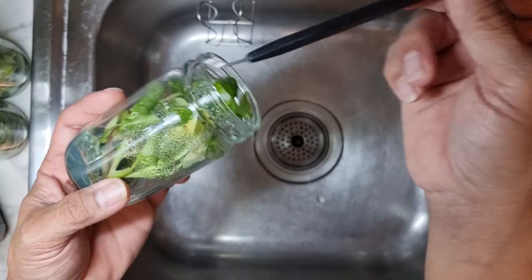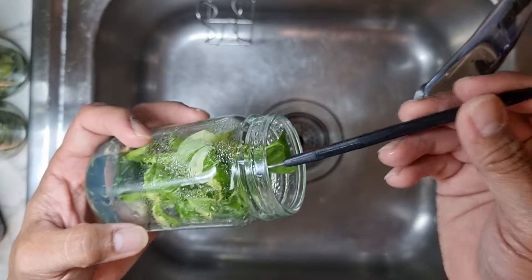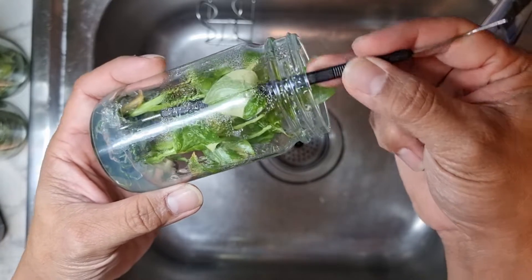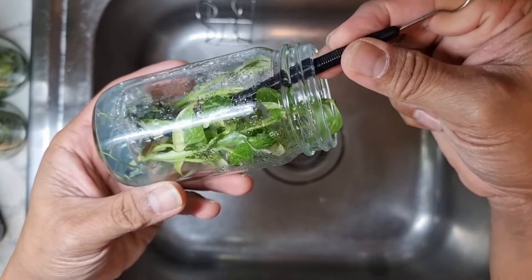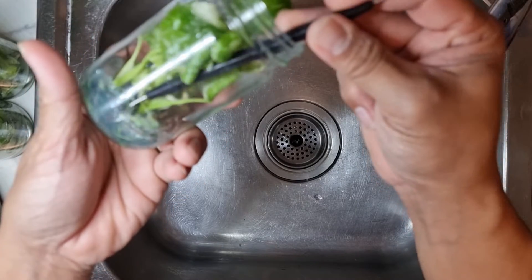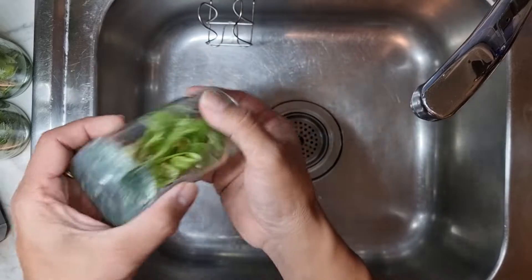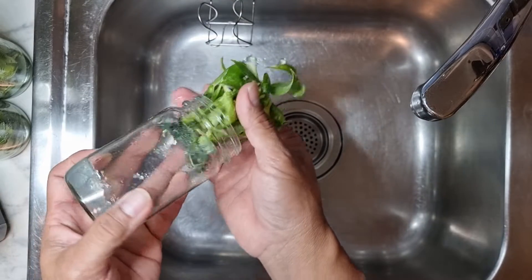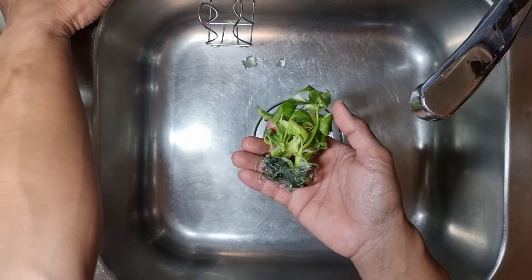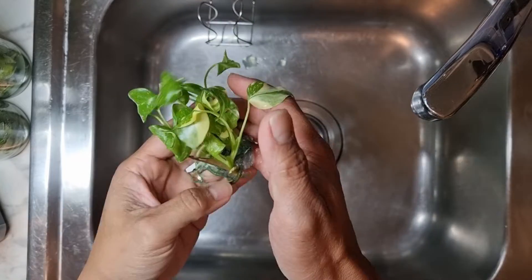If they all want to come out as a whole, that's fine. Get the hook inside and twist it, trying to crack each plant off the agar. Once we've got them cracked, push it down so it can easily come out as one.